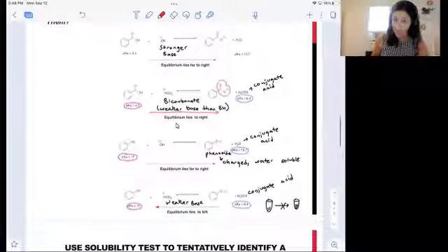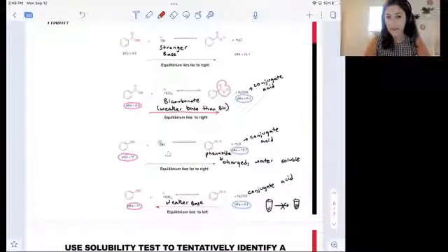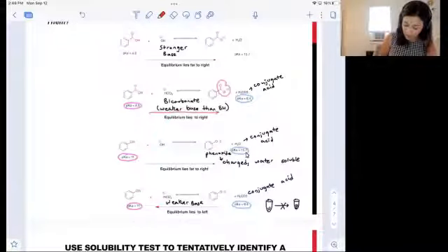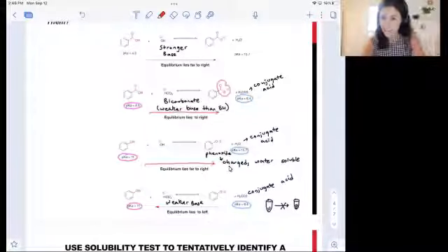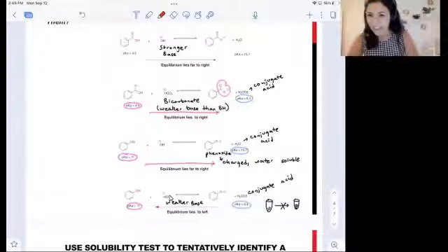By contrast, let's take a look at the phenol. In the presence of sodium hydroxide, the phenol will become deprotonated, forming a phenoxide anion. Charge, again, tells us that this will be water soluble. I form the conjugate acid, water, and if I evaluate this equilibrium, I'll find that it does in fact favor the products. I'm going from the lower pKa to the higher pKa number. One of these things is not like the other.